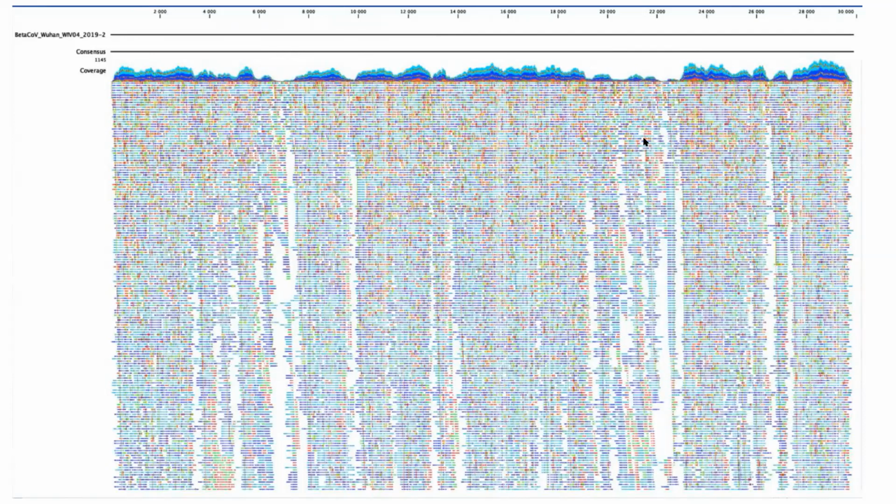Nevertheless, what that allows us to do is to understand the overall sequence of this genome and create what's called a consensus. The consensus is really where each individual read is agreeable to what is in the reference, and also agreeable in terms of the differences from the reference genome.